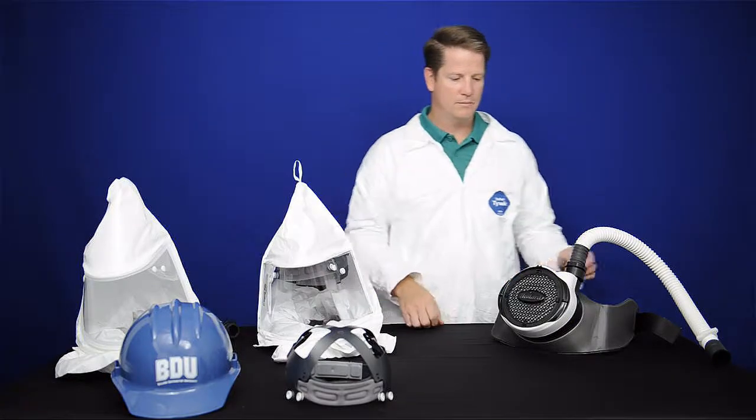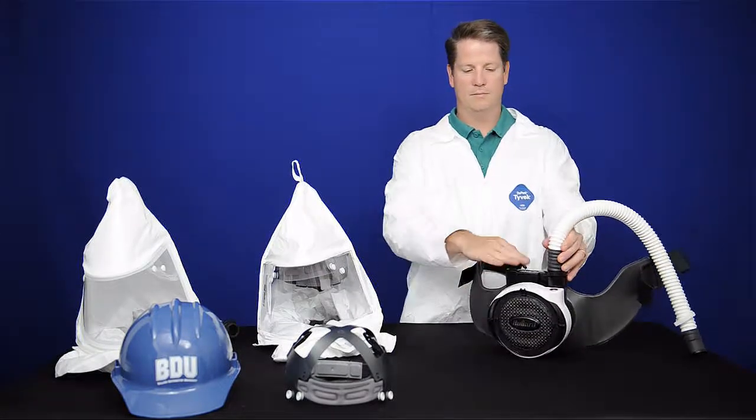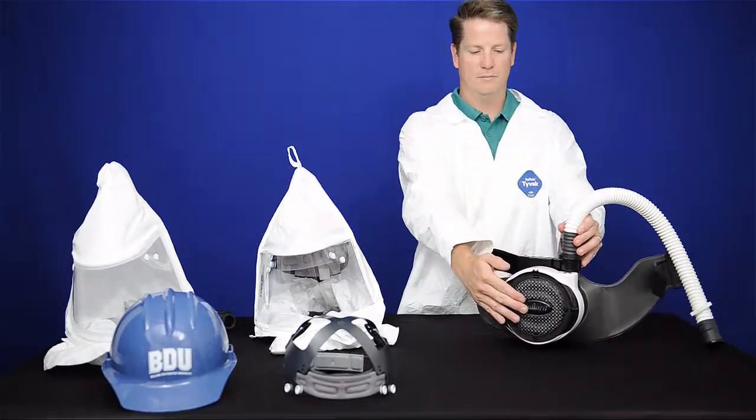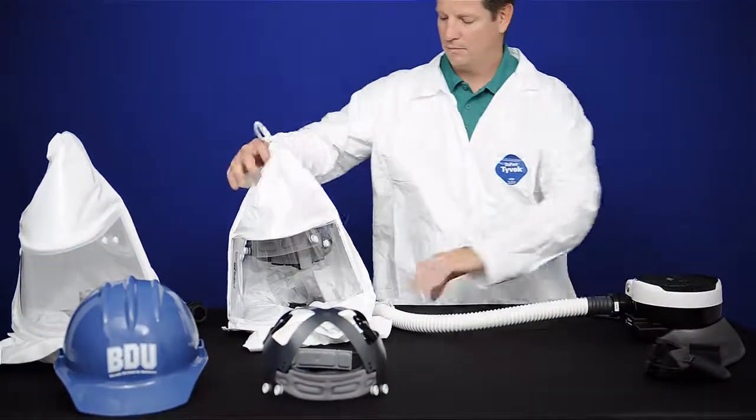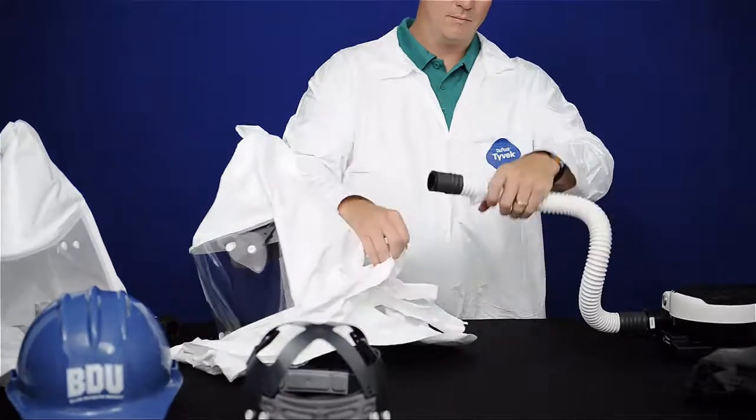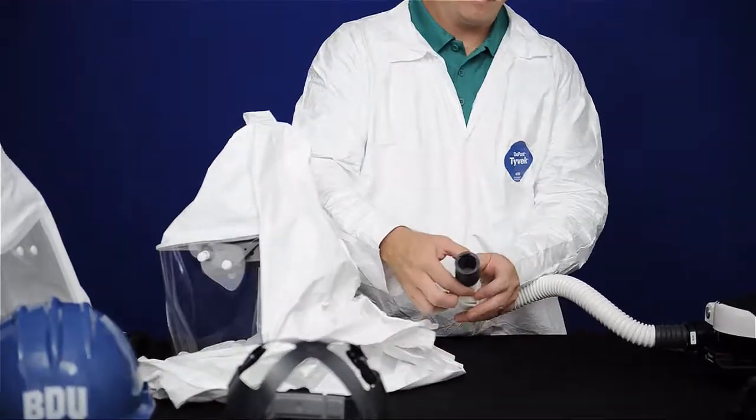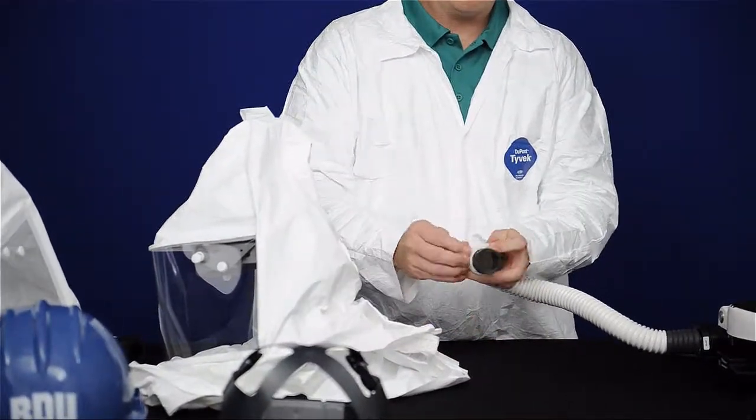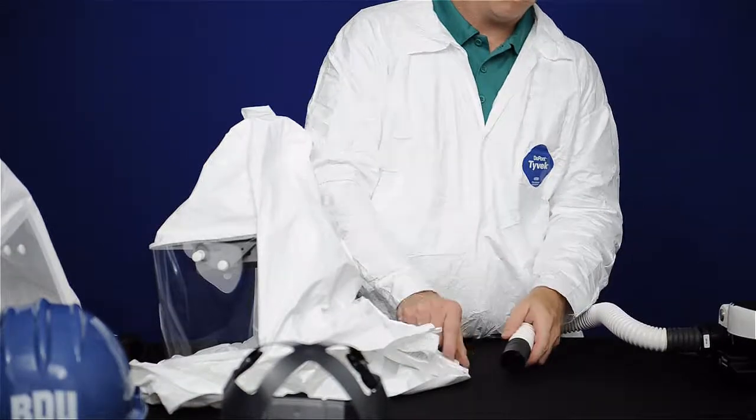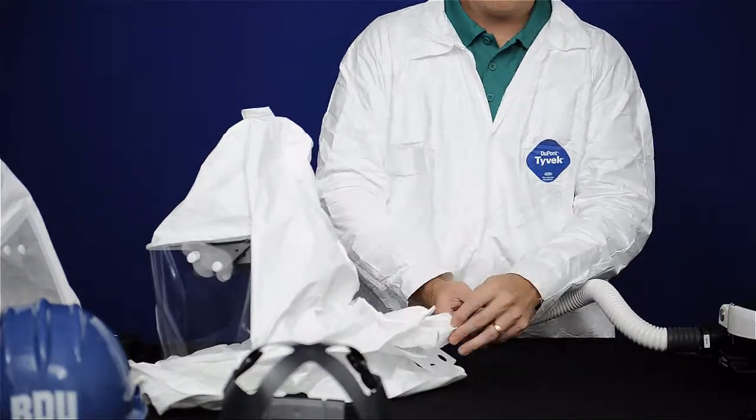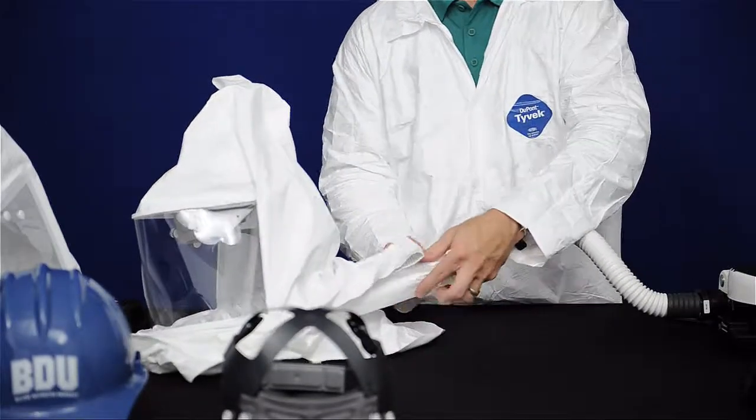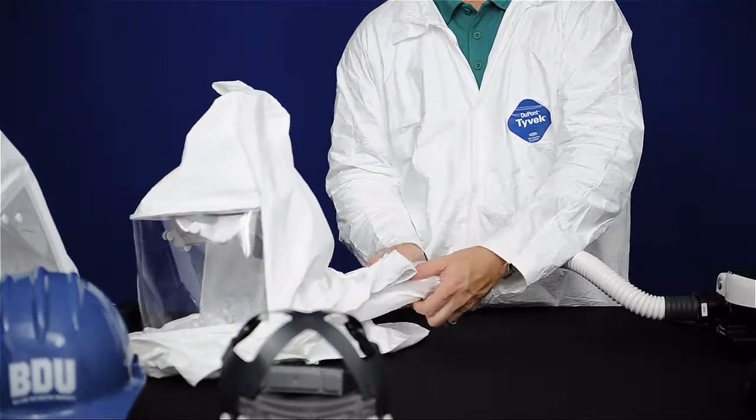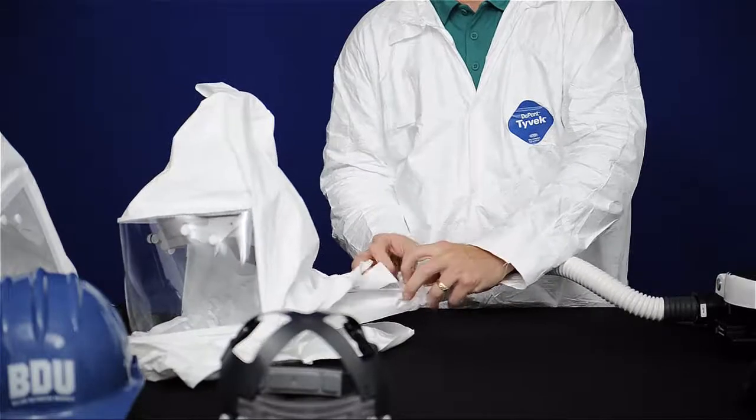With the PAPR belt, battery, breathing tube and filter installed onto the blower, insert the breathing tube approximately 5 inches into the air entry sleeve and secure with the clamp by squeezing until tight.